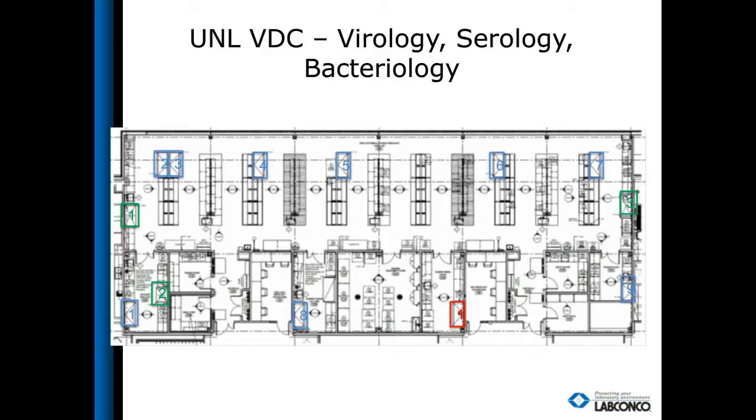So if they say, we're buying, for the sake of simplicity, 100 biosafety cabinets, and I need 10% of those to be exhausted, the designer will design a lab space with 90 biosafety cabinets that are recirculating and 10 that are B2s, hard ducted, and can never be converted. And that facility is now stuck with a very rigid infrastructure that cannot change as it goes on. A's cannot become B's, B's cannot become A's. They are what they are.